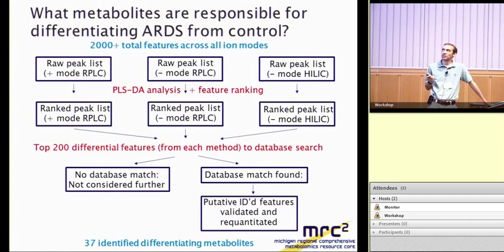For those compounds which had a database match, we did more work to confirm the identity, for things that we were confident we were able to identify within the context of using standards. Not just saying, oh yes, we have a hit, but going back and running standards, or looking at standards that we've previously run, and seeing that things match up.